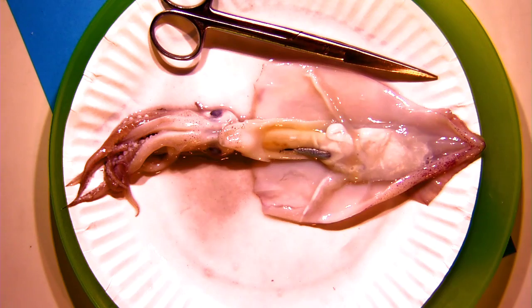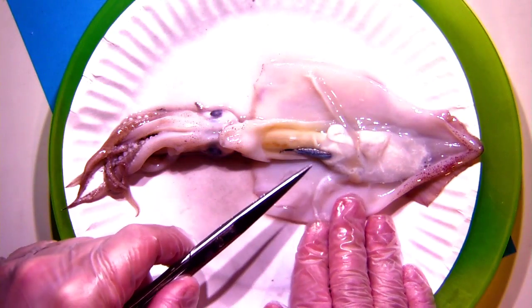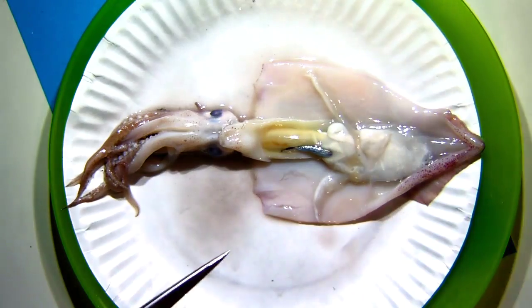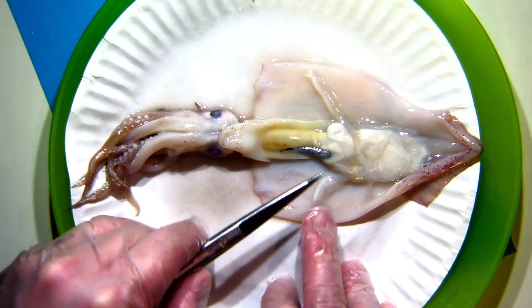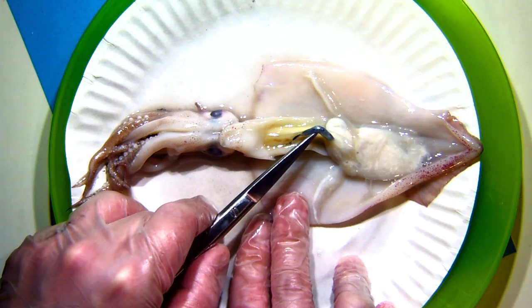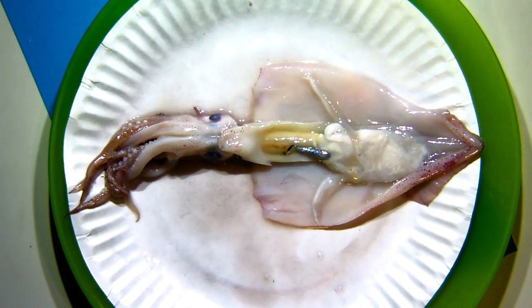Some folks are starting to wonder about the other organs visible inside this squid. We've talked about the gills. The next question is: what is that silver thing? That silver thing, my friends, is our squid's ink sac. I'm not going to break it open now because there would be black ink all over the place. So I'm just going to leave it as it is for the moment.